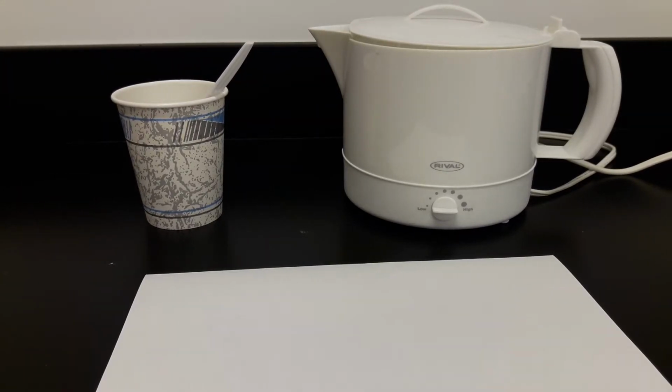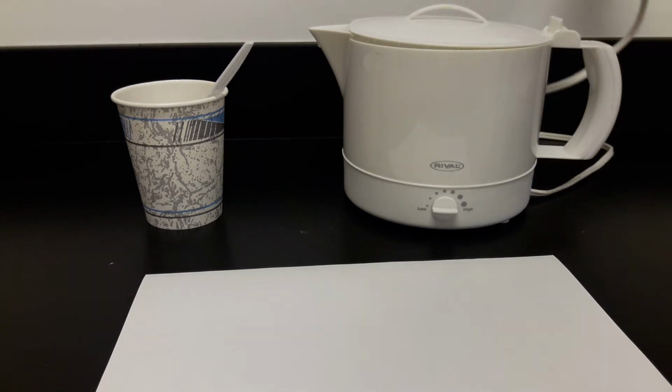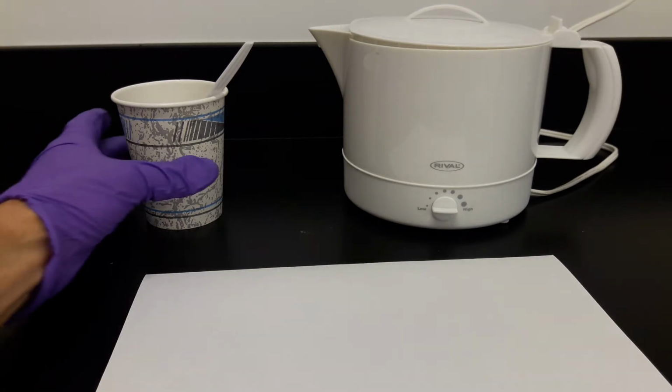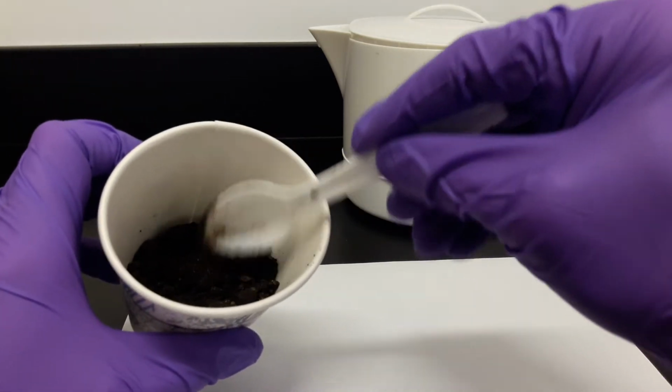For this next exercise, we're going to be taking some Athabasca oil sand and cleaning it. We're going to do so by using some hot water. We're just going to plug that in, wait for it to boil, and then pour it into this cup while stirring.